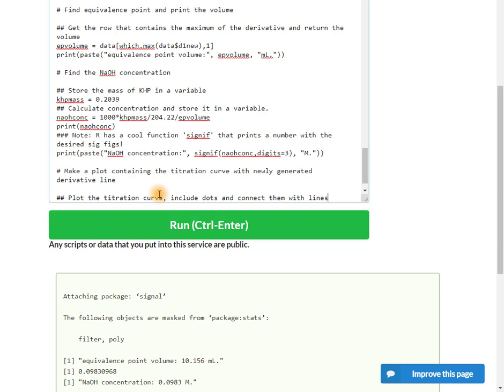Very quickly, you're going to learn the limitations of some of these commands. There's going to be a lot more efficient ways to do this. I am by no means an R expert, as some experts might see if they've been following along here. But we're just trying to keep things as simple as possible and not worrying about making visualizations and displays pretty.